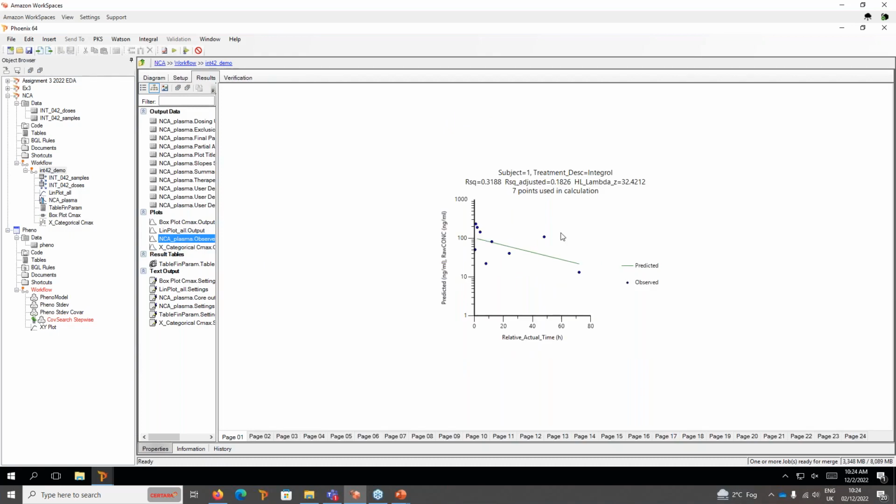Notice actually one of these samples, most of the data looks pretty nice, but here there's something odd going on in this profile. I might want to query that. Anyway, that's my draft analysis done. So I'm going to go to Integral, click Save.